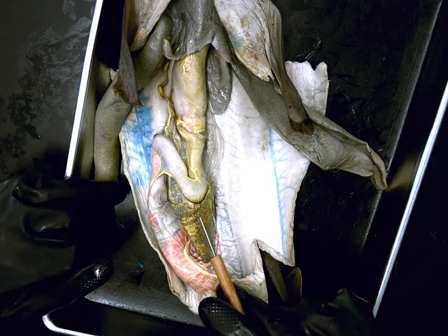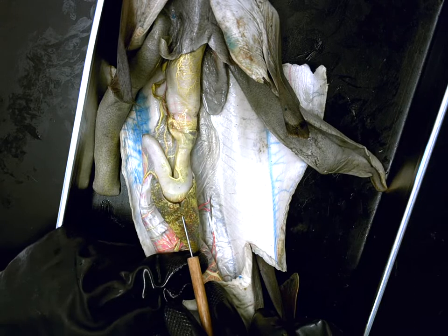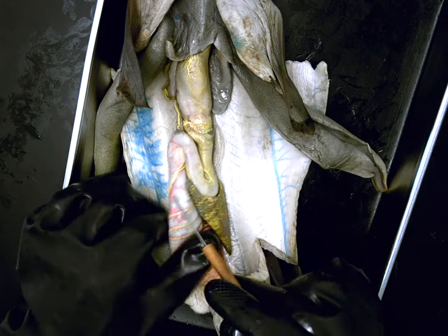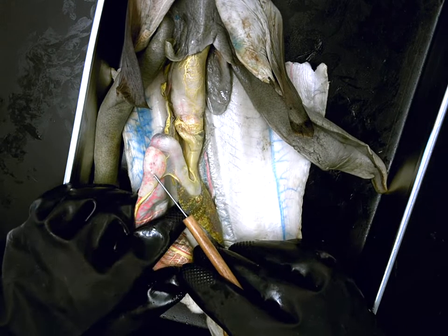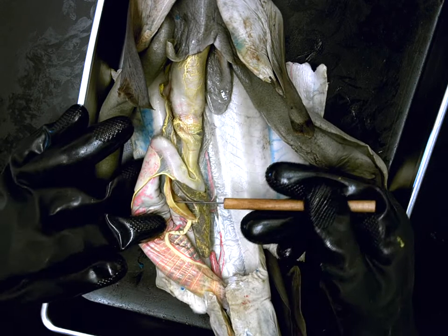That would be what, Melissa? Spleen. Functions. Excellent. Then if we go here at the junction of the stomach, right where the curve goes down, there's this nice round flat structure. This flat structure would be called what, Phoebe? Pancreas. All right. Ashkin, what is this structure right in between the two?